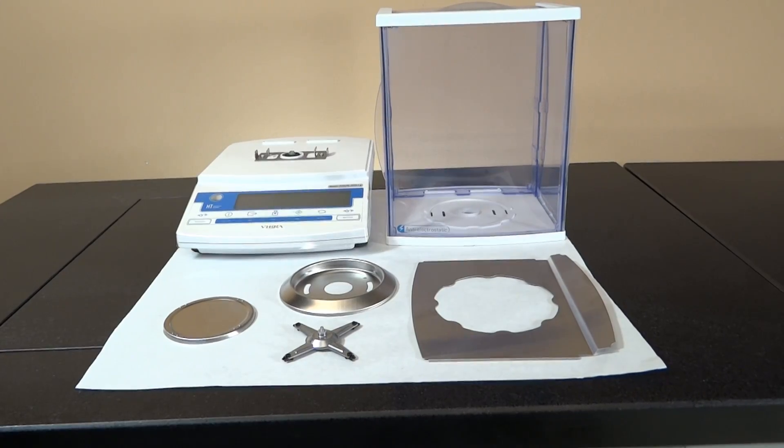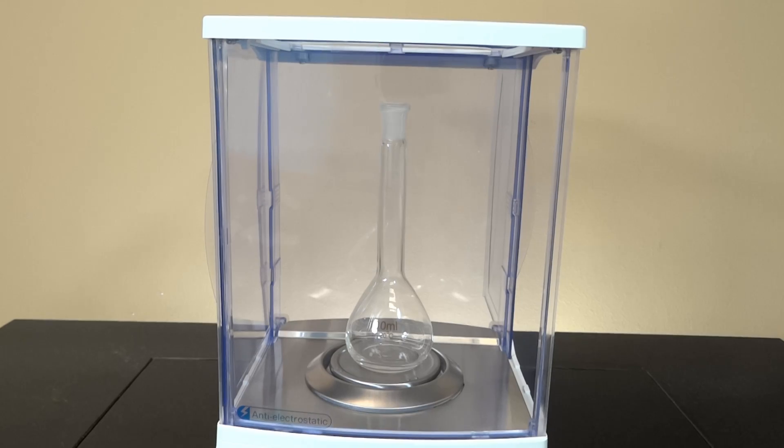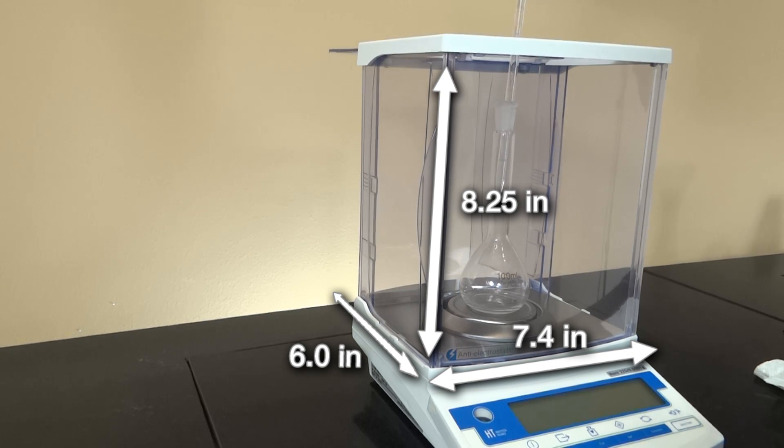Each piece can be quickly removed, making cleaning easy. The spacious weighing chamber offers plenty of room for large samples or pipettes.